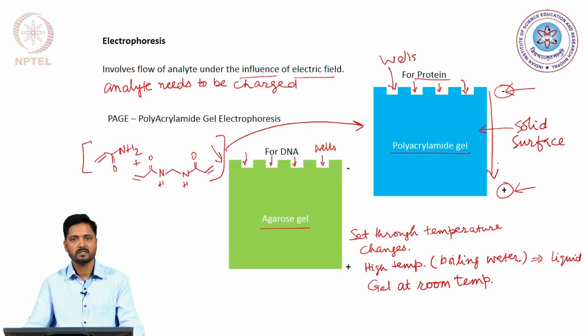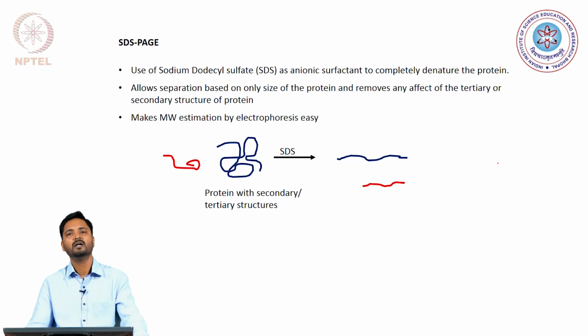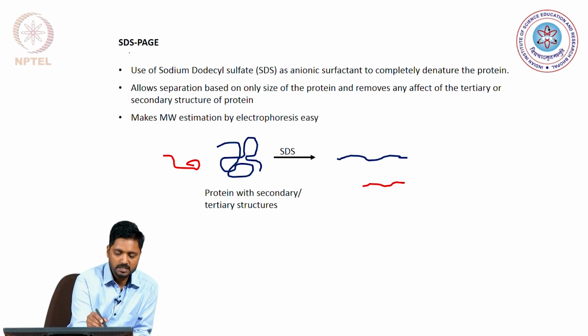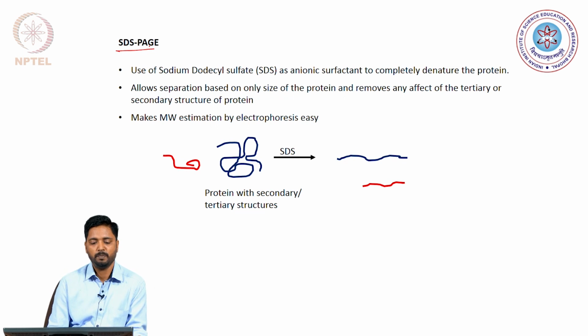However, as this protein moves through this gel network, it also experiences a drag. So, we will get introduced to these concepts in subsequent slides, but let us see a different protocol which is often used when purifying proteins based on the molecular weight, and that is known as the SDS-PAGE.